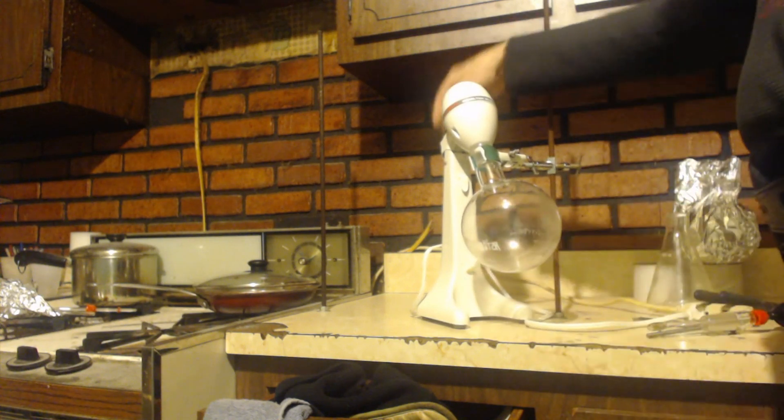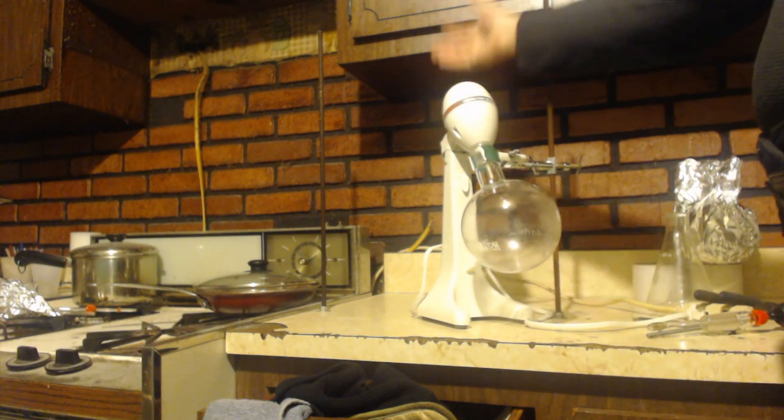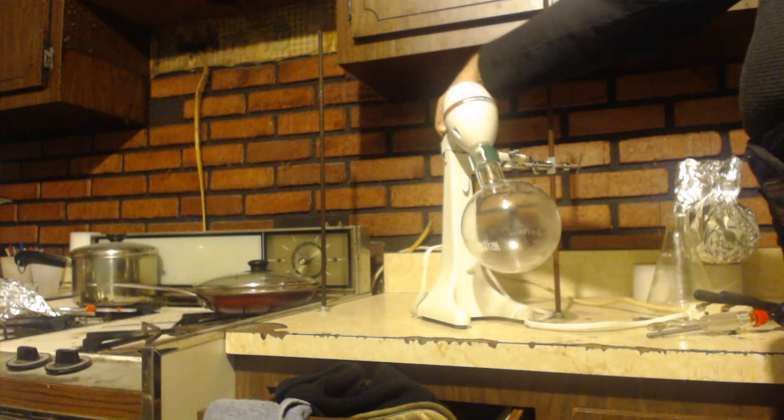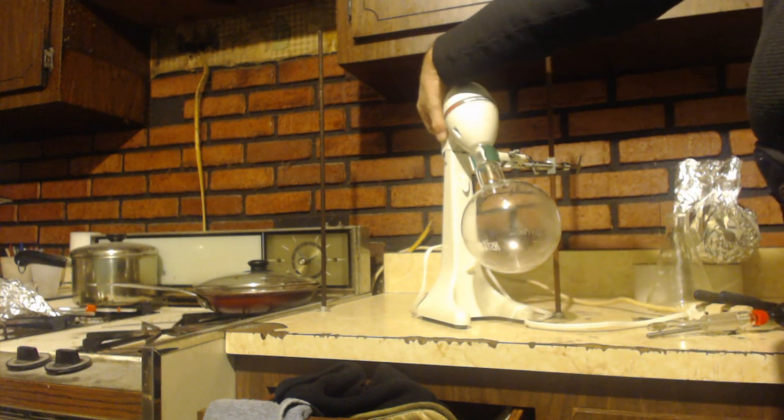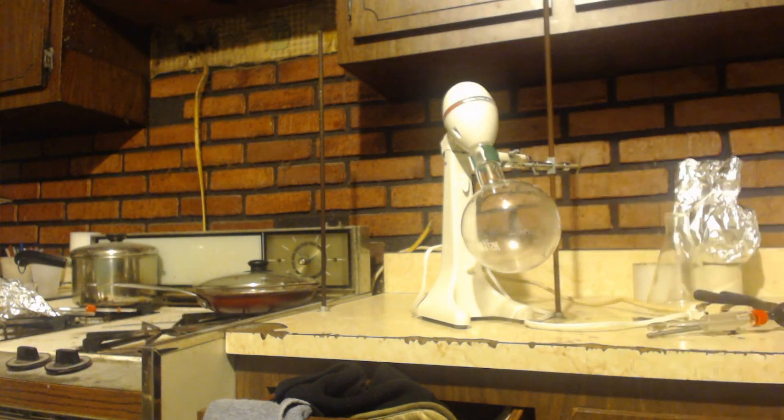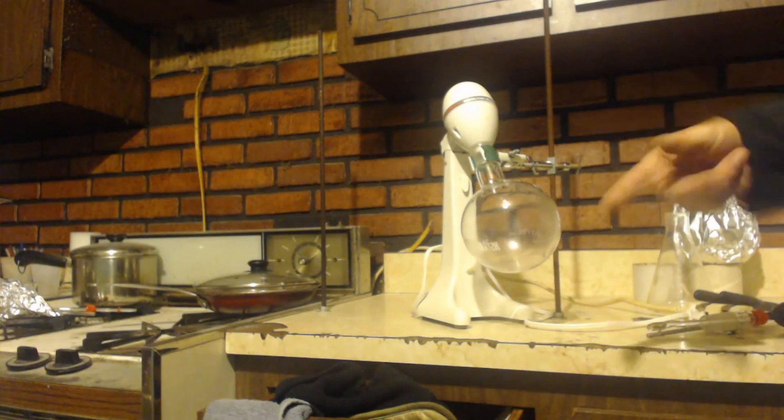Exactly. You can just turn it on. Then you'd be able to get the round bottom flask to start.